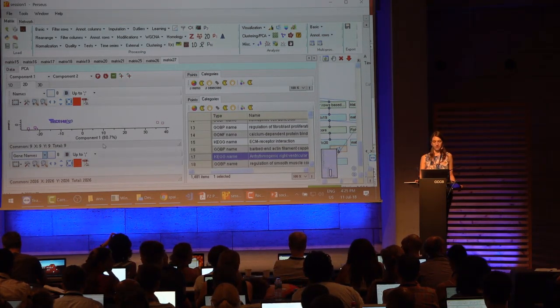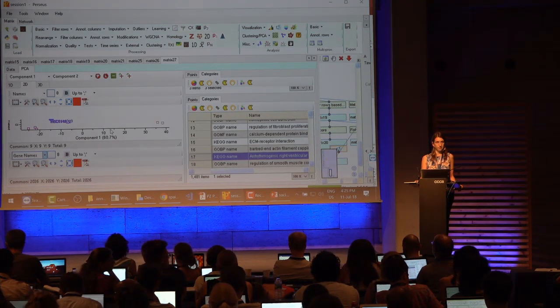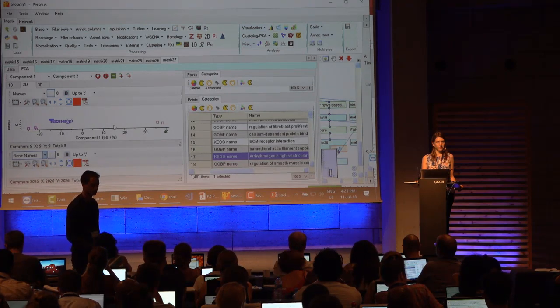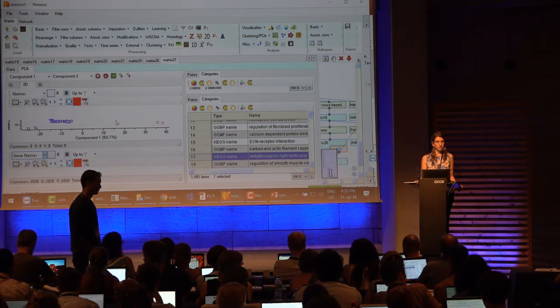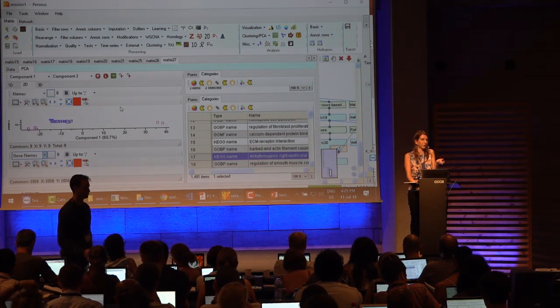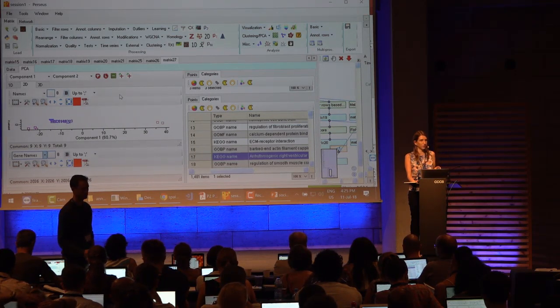So in the enrichment analysis that you're doing based on the clustering and the previous clustering, how would the fact that you are choosing how many clusters you want affect the enrichment analysis you are doing afterwards? So for example, instead of 5, if you put like 10, and then you do the enrichment analysis, how would these two enrichments compare between each other? They will be different, right? Because you're looking at a different set of proteins. That's why in the first step, when you define the clusters, you need to have some rationale as to why this is the cluster that you're interested in. So of course they'll be different. It's completely different proteins you're looking at.